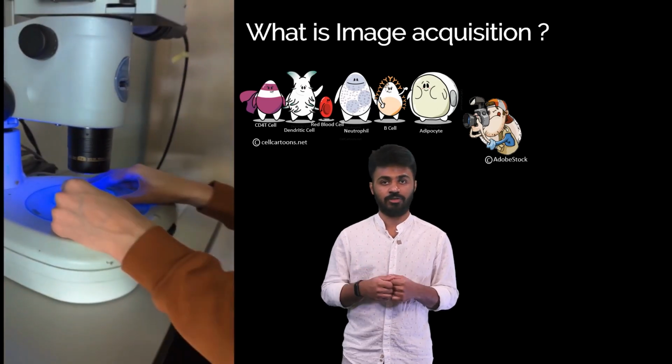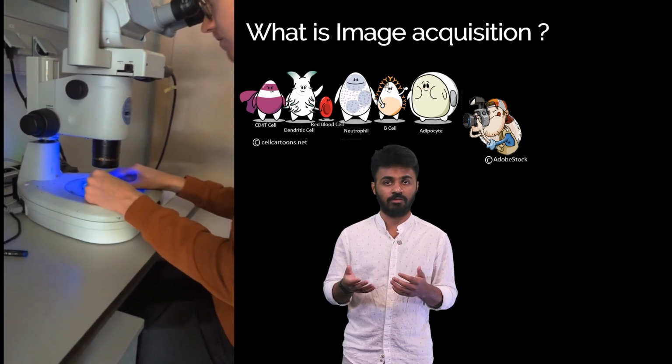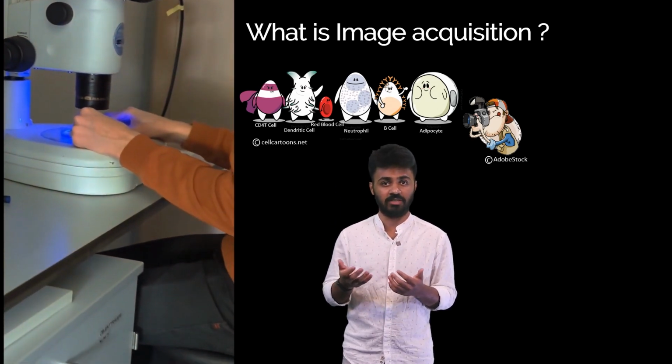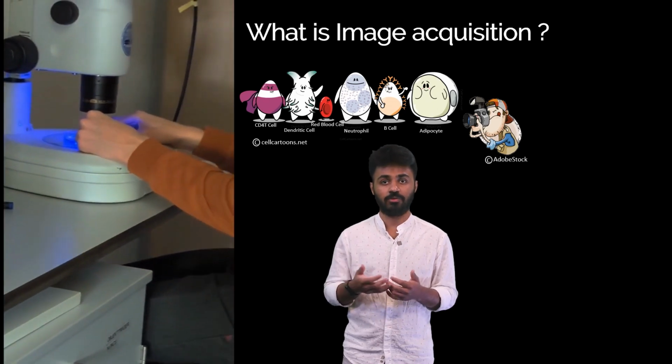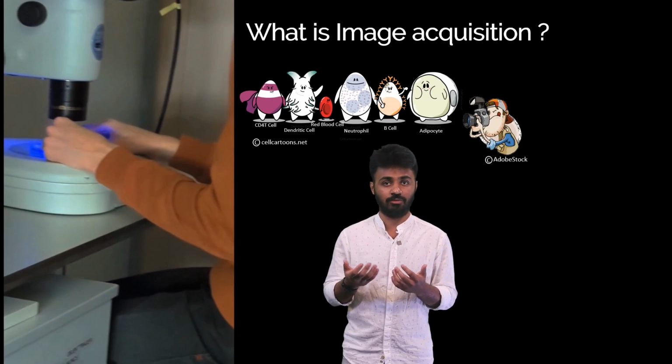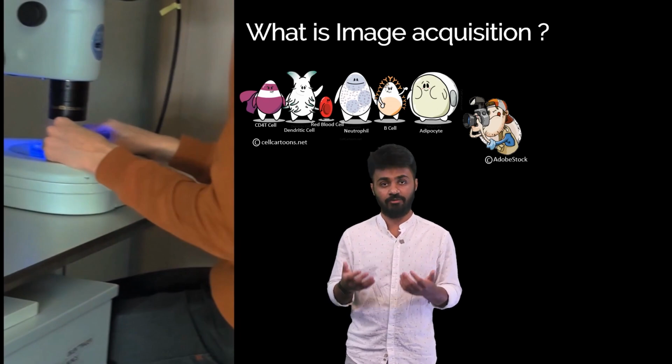What is image acquisition? Image acquisition is the process of capturing digital images of biological specimens using various imaging devices such as microscopes, cameras, and scanners, aiding biologists and other life scientists to study the intricate details of cells and tissues to understand their functions.